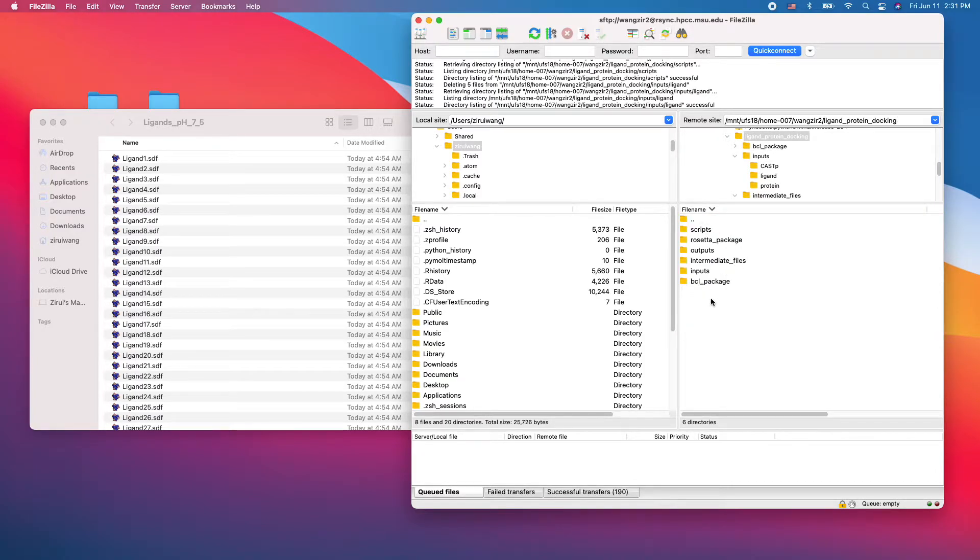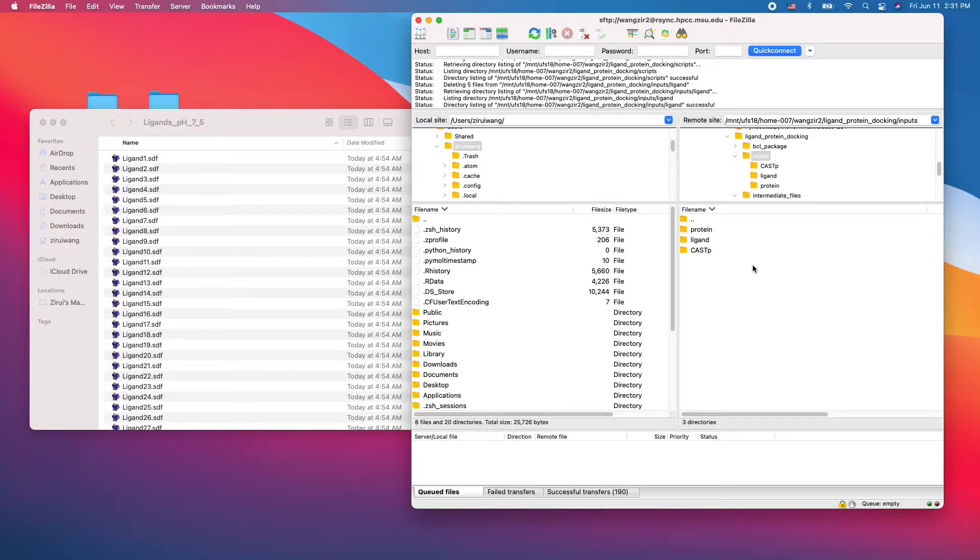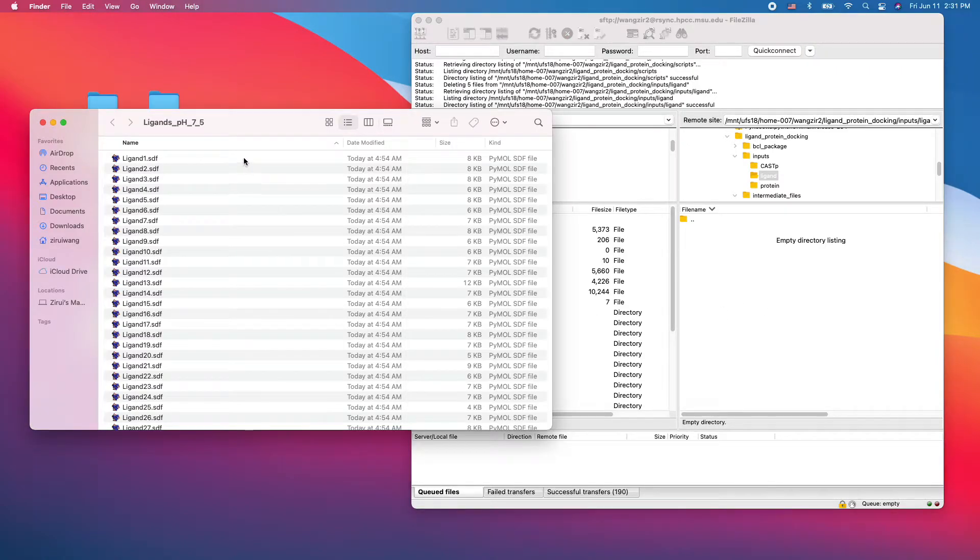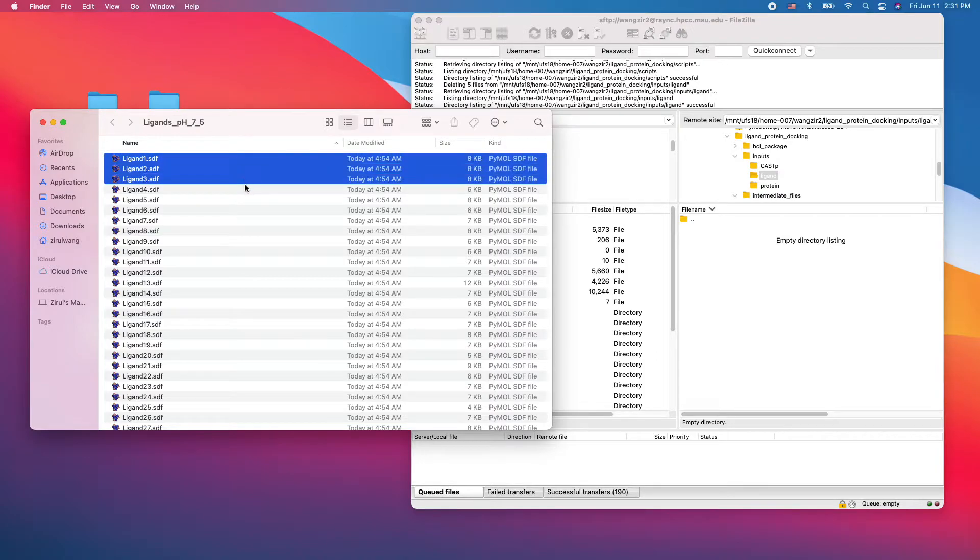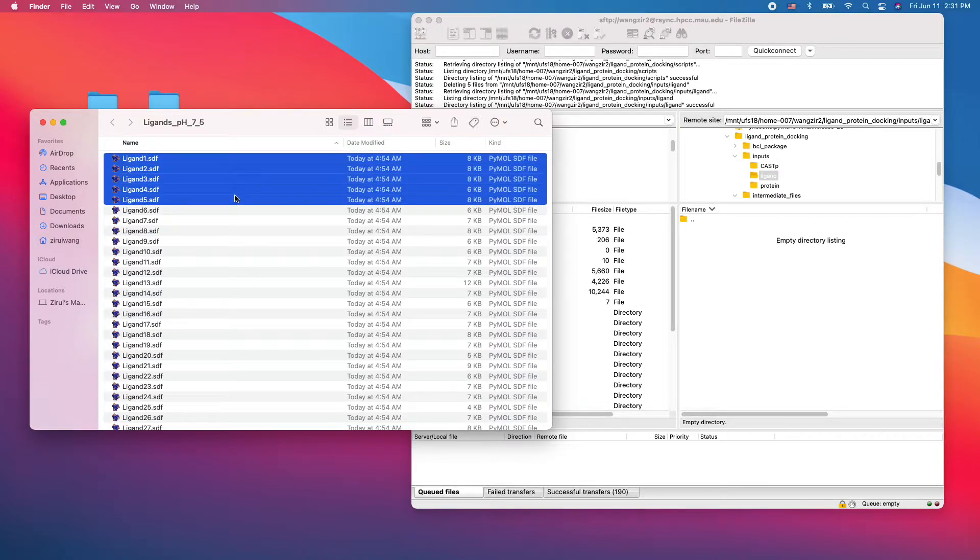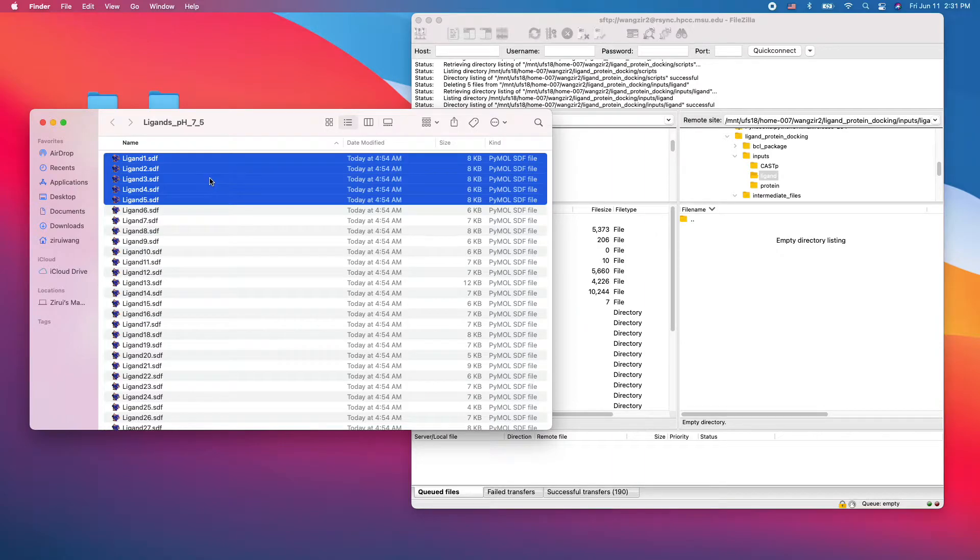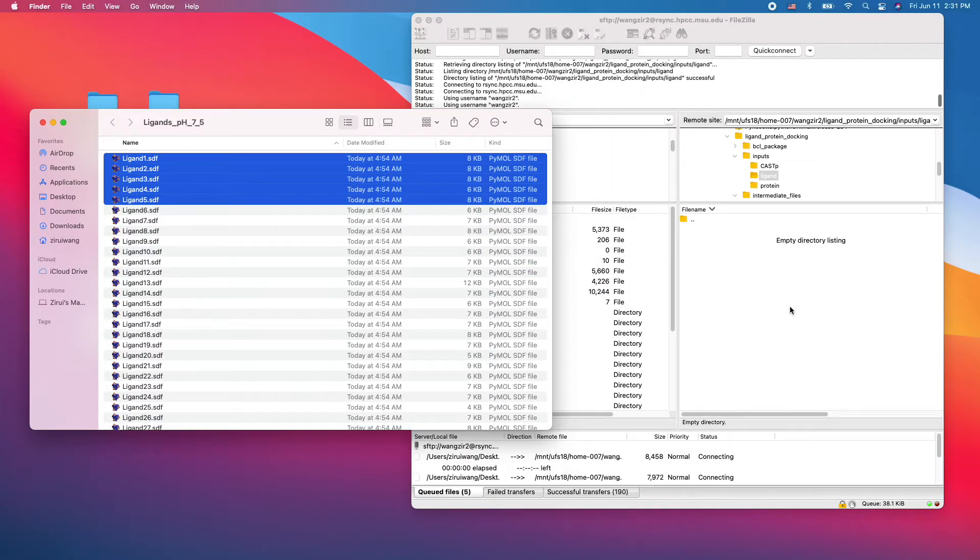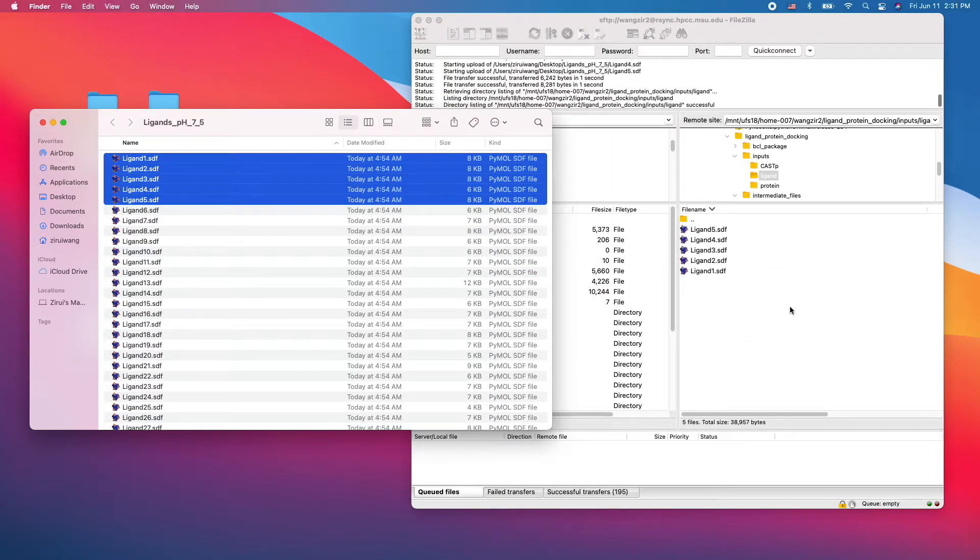Okay, so first step is go to inputs and ligands and we are going to upload some ligands. I'm only going to do 5, so to save time. Okay, let's just drag this ligand into our ligand folder.